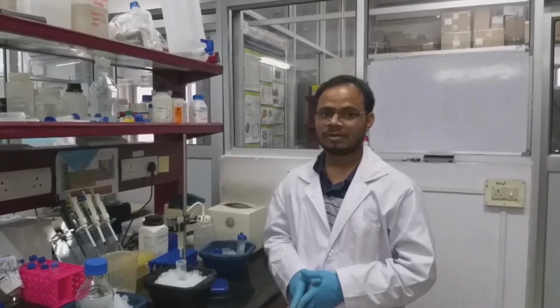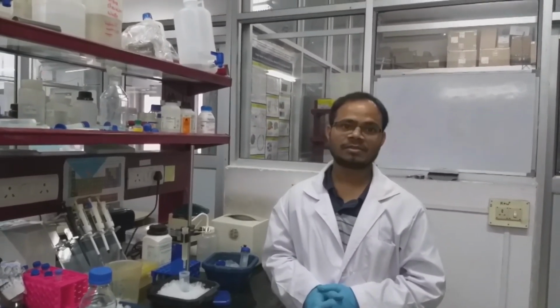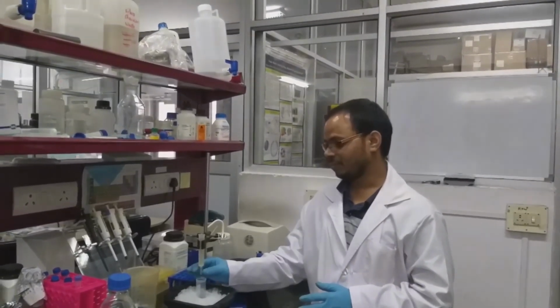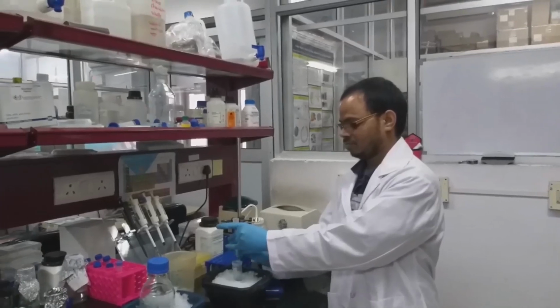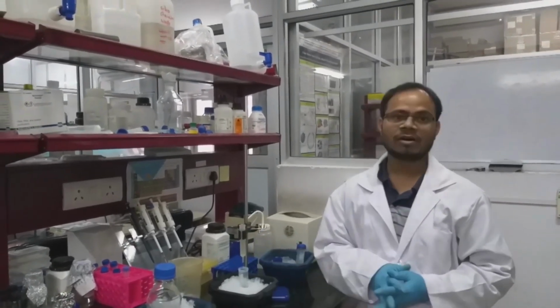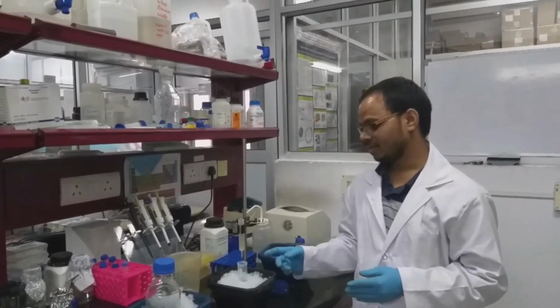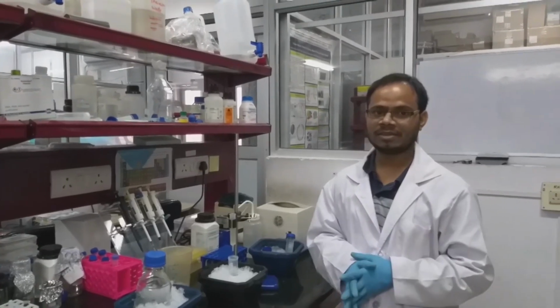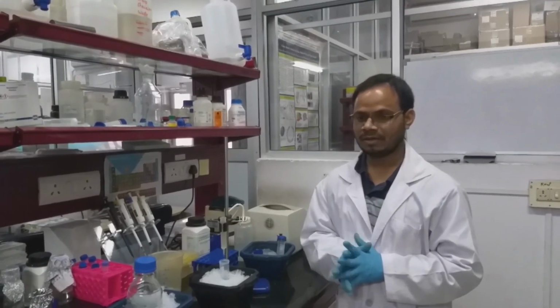After incubation with beads, we have to follow another 3 steps to get the purification done. First, after the beads are taken out from ice, you have to remove the outlet so that all the flow through other than beads will be taken out. The next step is we have to wash with the equilibration buffer. And the third step is we have to elute the His-tag protein using imidazole containing buffer.